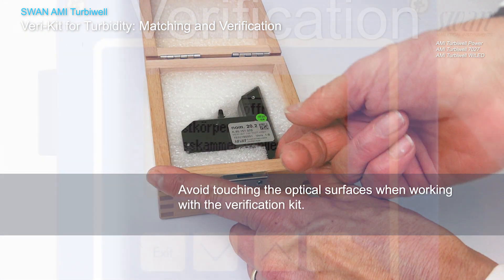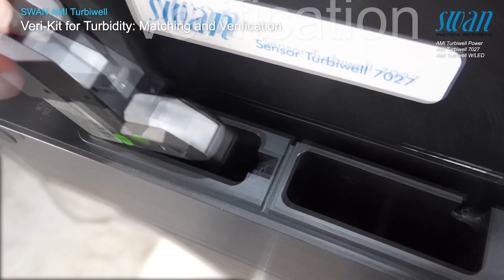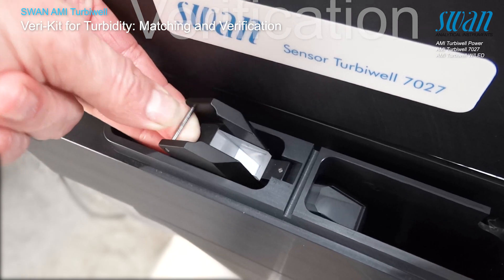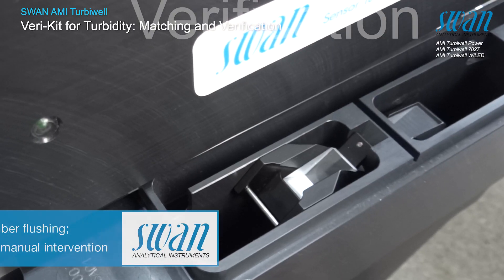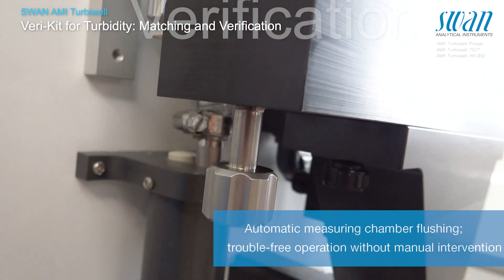To avoid misting of the glass prisms, make sure that the verikit and the measuring chamber have the same temperature. Insert the verikit and ensure that it is fastened correctly. Close the measuring chamber and start the verification by pressing enter.